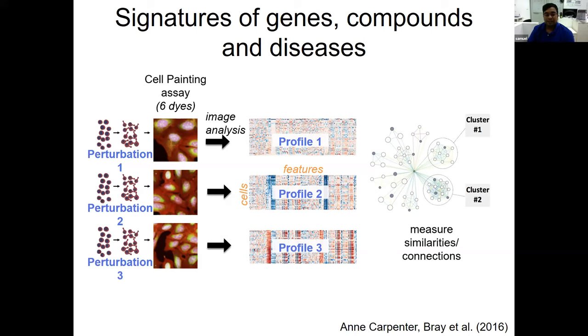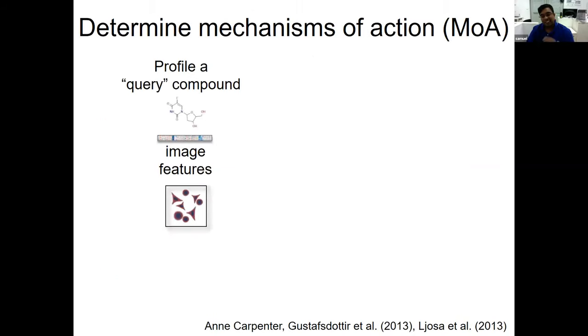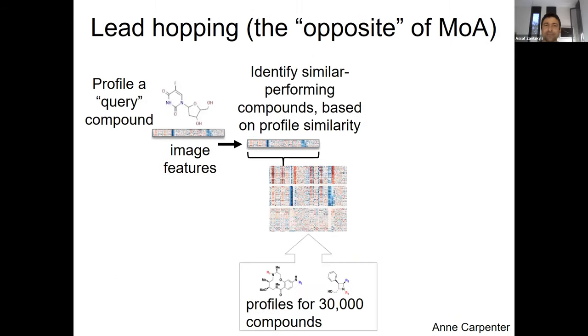Okay. So if you try image-based screening for a drug discovery process, there's a chance that it will fail a lot of times rather than if you do it in a wet lab. I mean, you do it in a wet lab. You image your cells, and then you do the computation. I don't understand the question. Let me think if you can clarify the question, okay? I'll do it, and then ask it again.